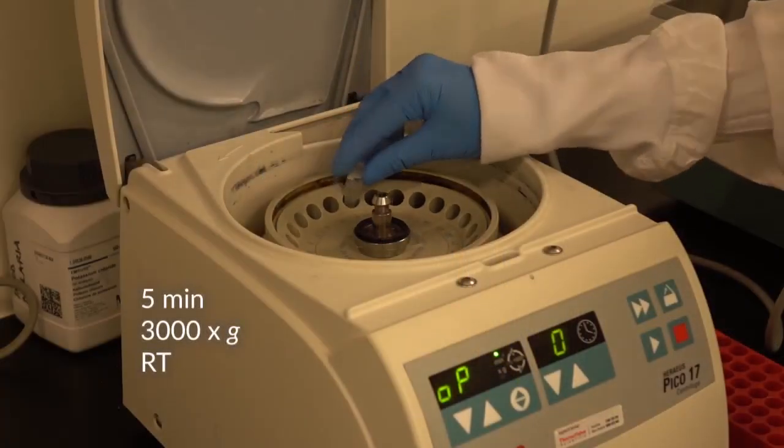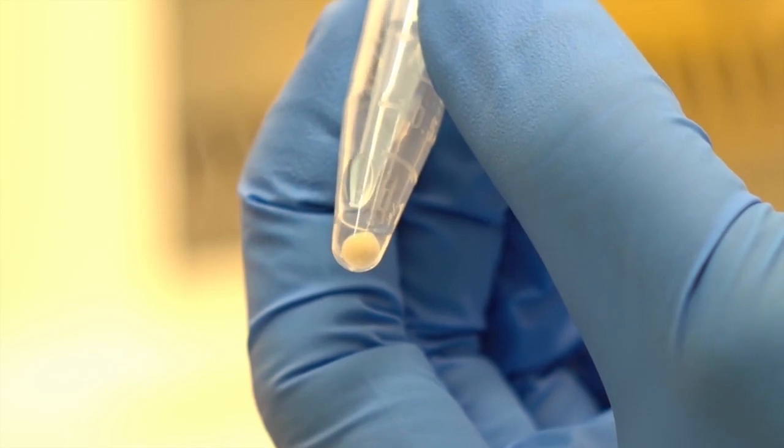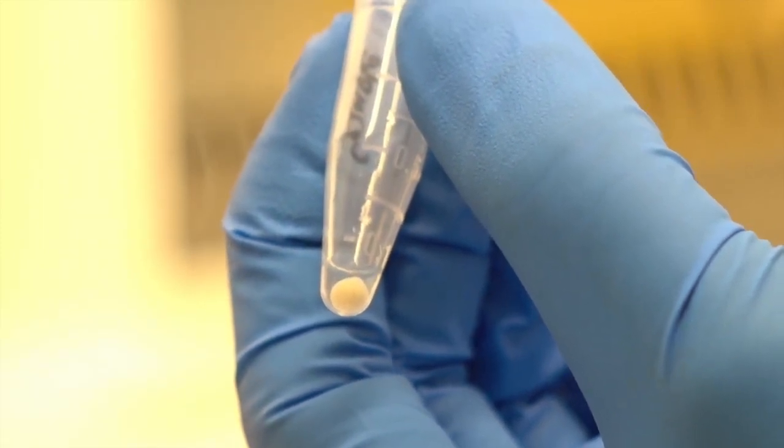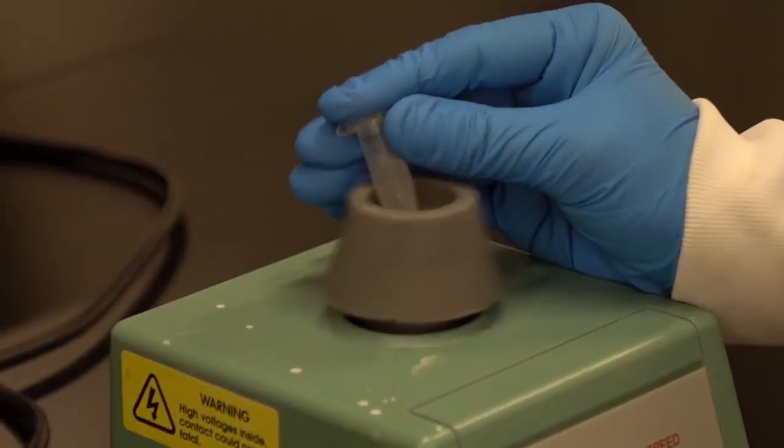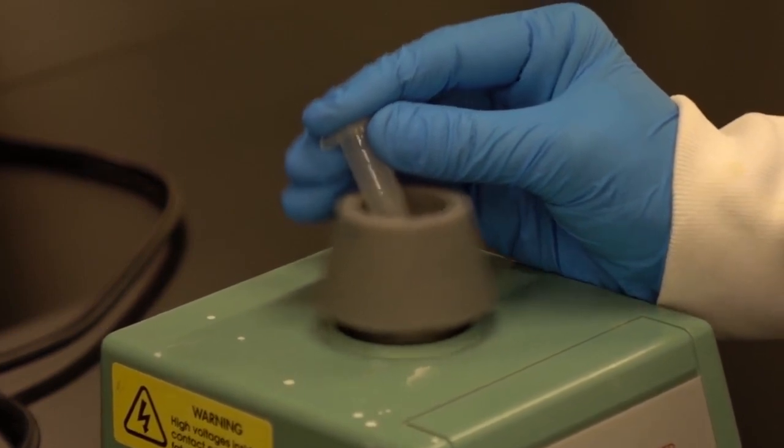Pellet the bacteria by centrifugation and carefully aspirate the supernatant with a pipette. Resuspend the bacterial cell pellet in one milliliter of ultra-pure water.